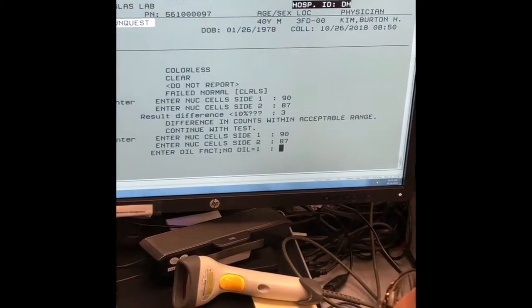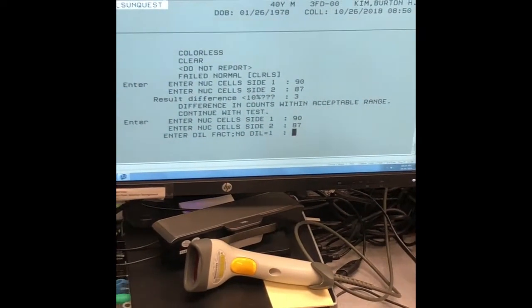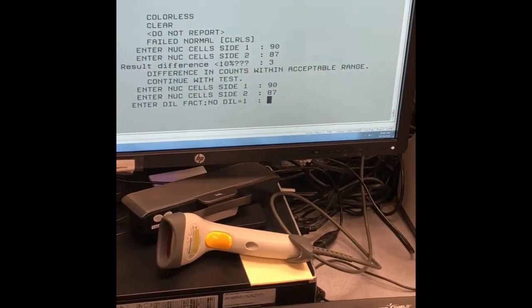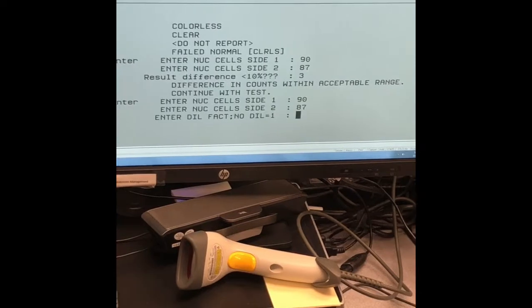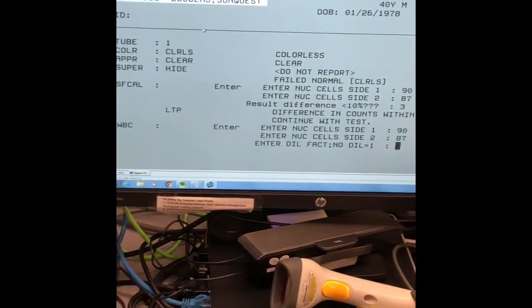Don't be doing us like that. You know what I mean? That ain't gonna work. So don't get crazy frustrated. But if you keep putting your data and you see that this is greater than 10, that's because something is wrong with your division or your count from the beginning. It actually tells you your difference is greater than 10 percent, and it'll tell you to repeat it.